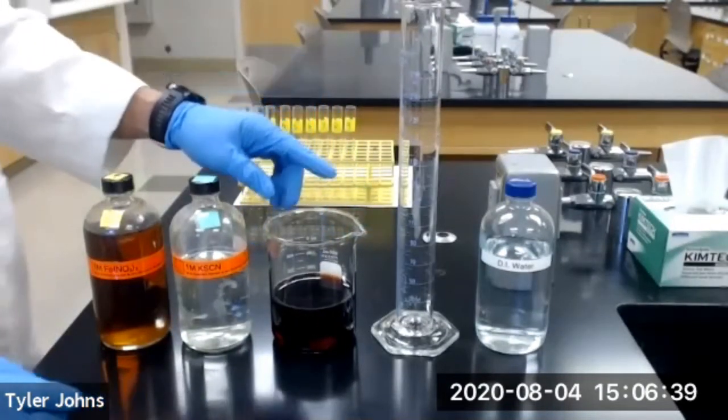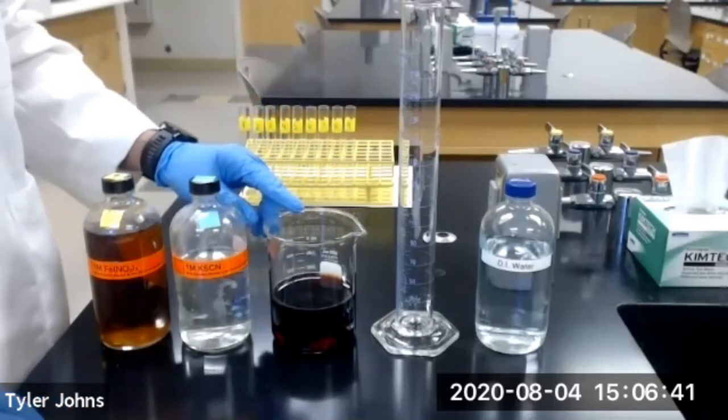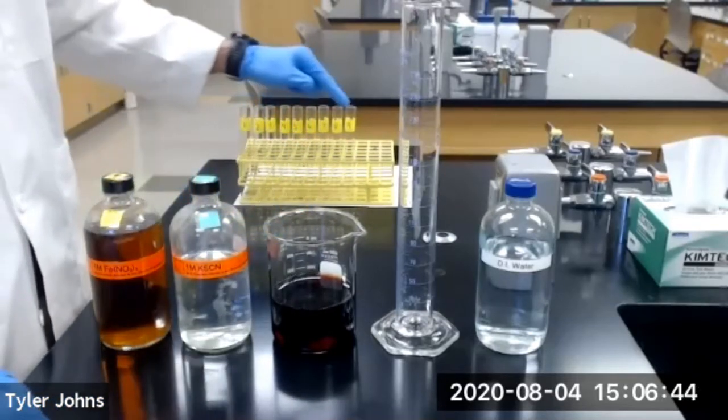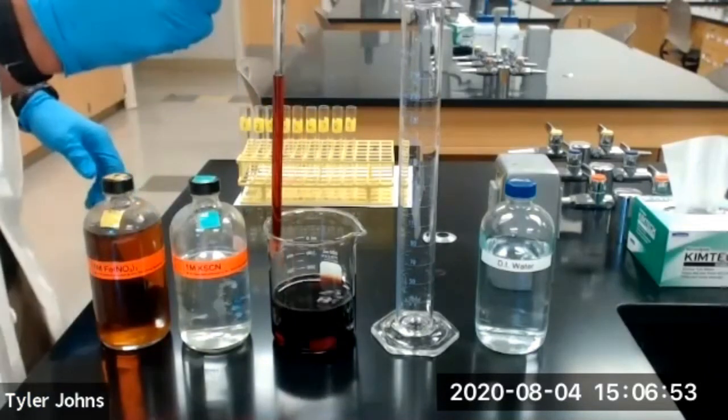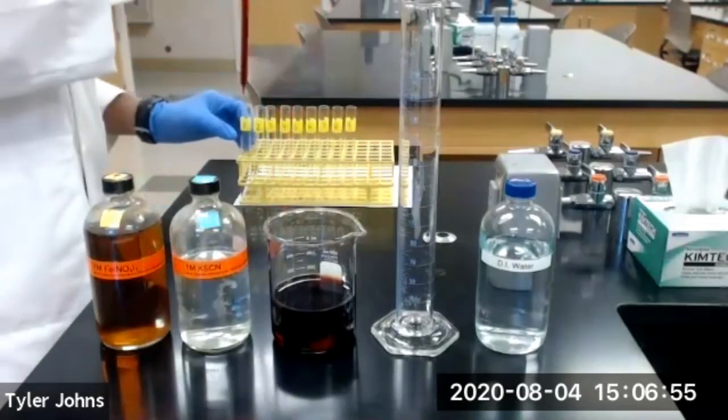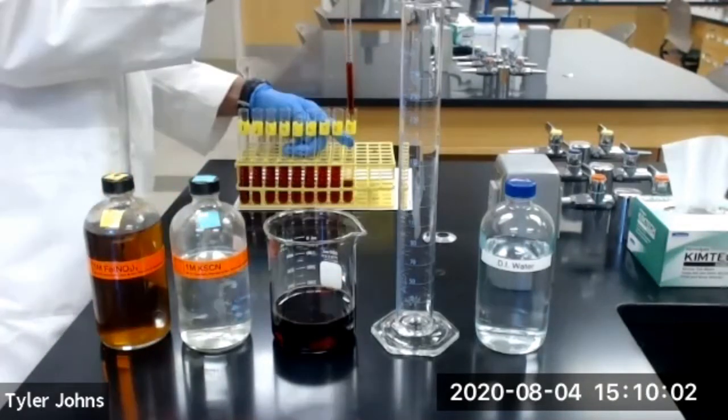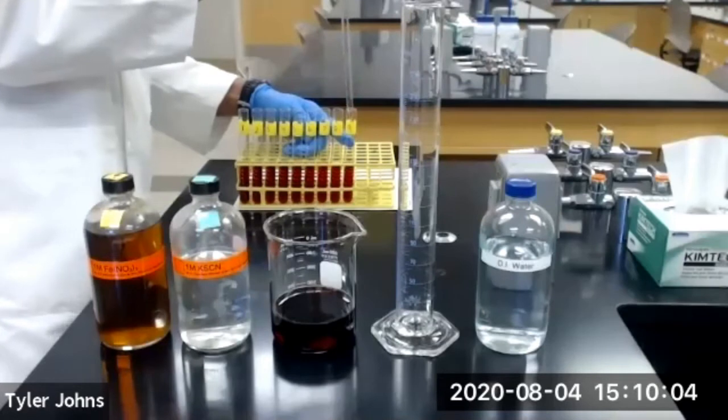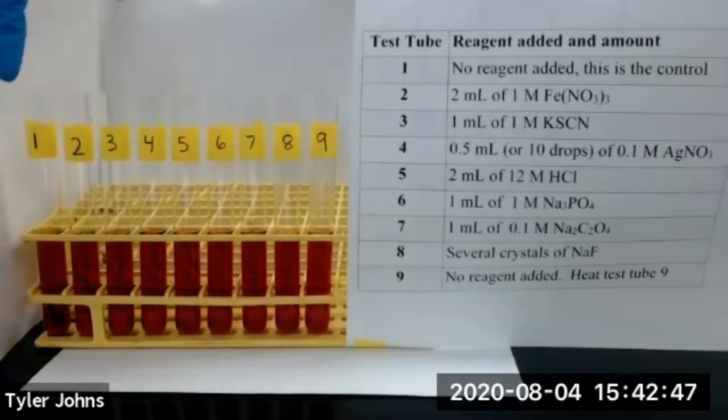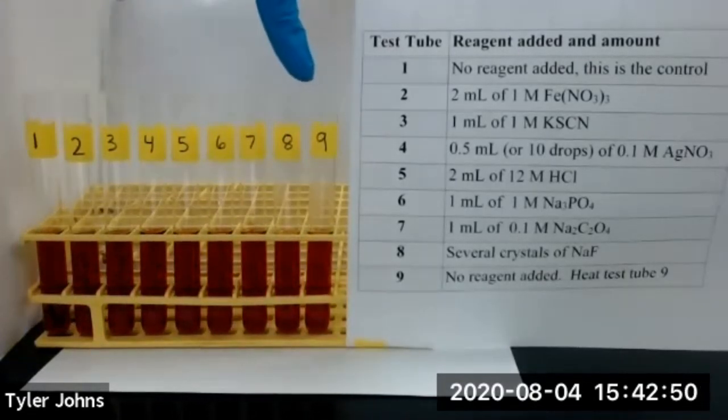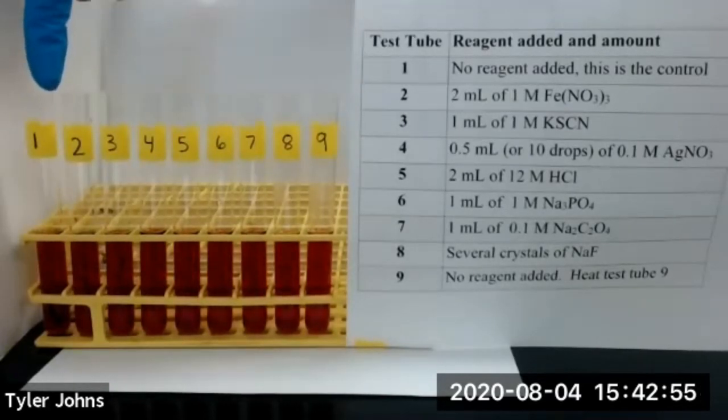We're then going to transfer 10 milliliters of our stock solution into nine numbered test tubes. Test tube one is going to serve as our control test tube and no reagent will be added to this test tube.